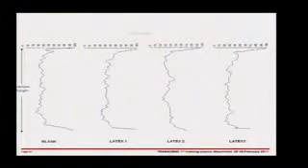So this was 4 blends with different kinds of latexes in. You can see what's typical is you get this edge effect. At the edge, the material's drying out, and it's not reacting so much.